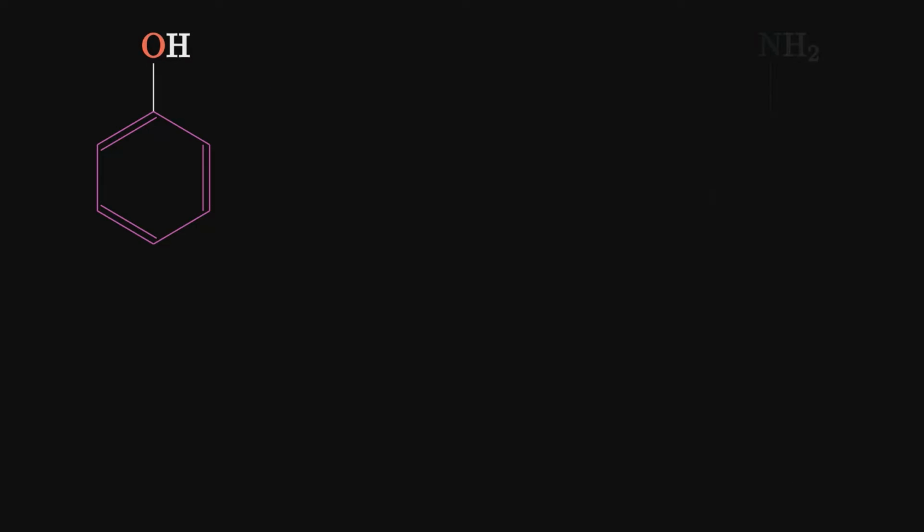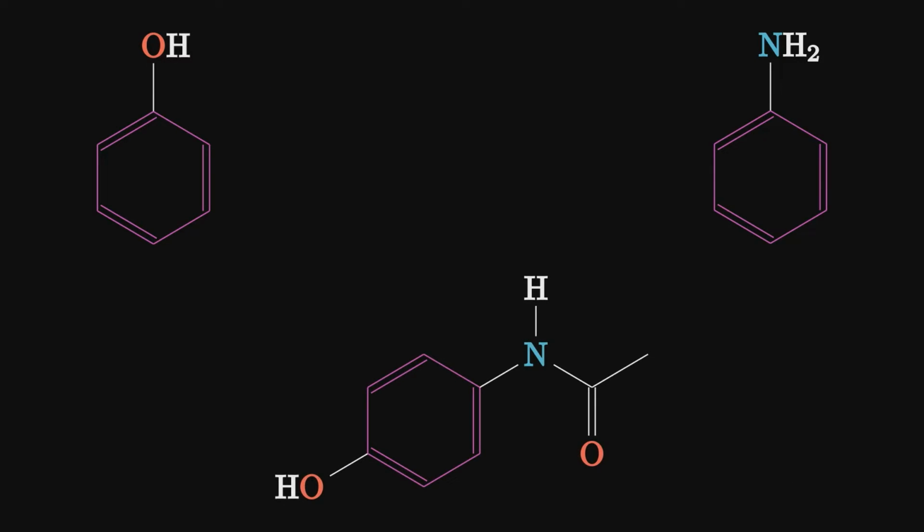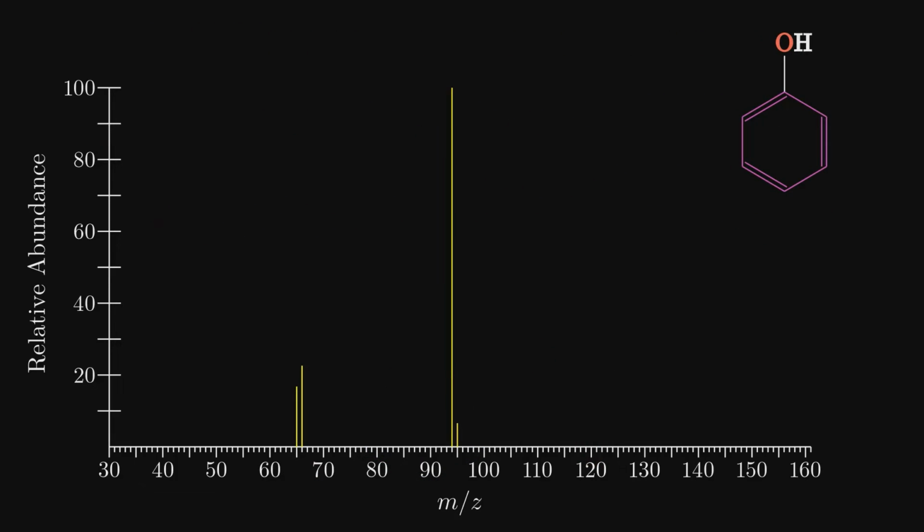For our last stop, simple aromatic compounds are molecules containing a benzene ring. Aromatic structures are fairly stable, and these rather simple ones like phenol to start often have clear molecular ion peaks. When provided the intensities for the M and M+1 peaks, the number of carbons can be calculated, and it results in 6 as expected. The peaks at 65 and 66 are largest after the base, and potential identities for these cations are C5H5 and C5H6 respectively.